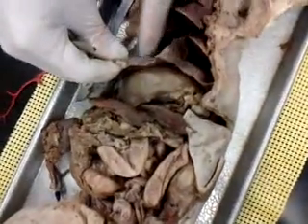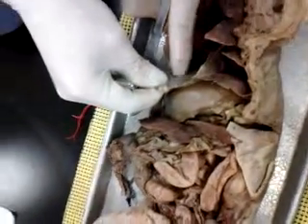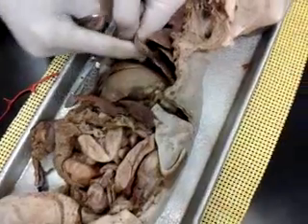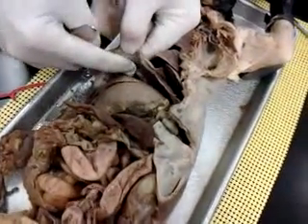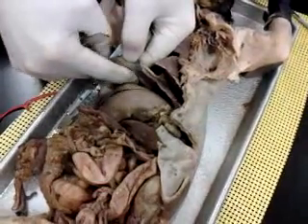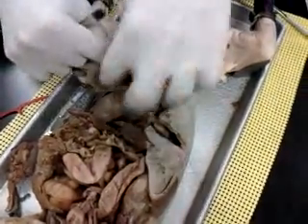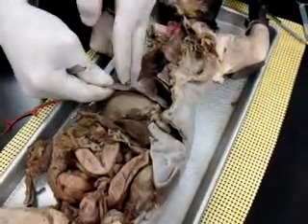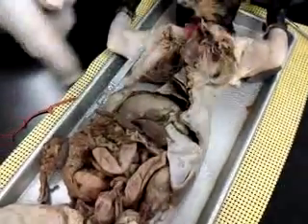Now here's where it gets tricky. What's this layer right here on the top of the diaphragm? Parietal pleura. What's this layer on the bottom of the diaphragm? Parietal abdominal cavity, peritoneum. Tricky. Diaphragm separates abdominal from thoracic cavity, so the pleura covers that. Peritoneum covers that. Kind of cool.